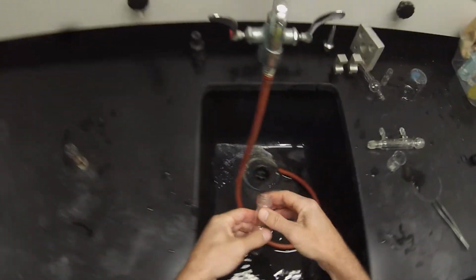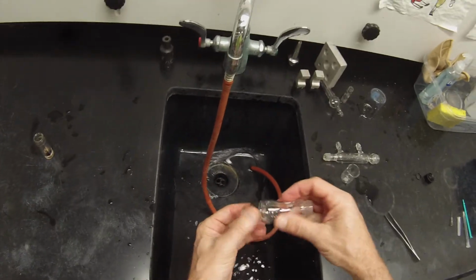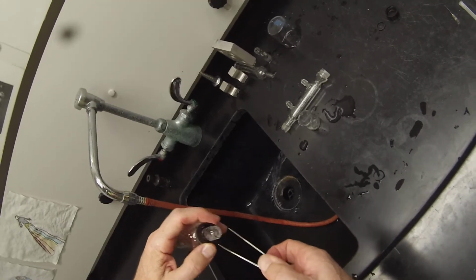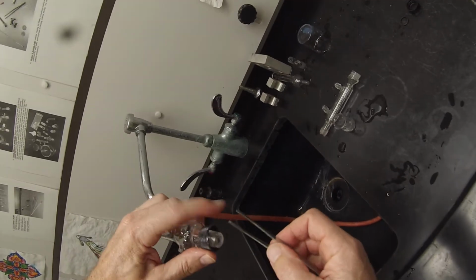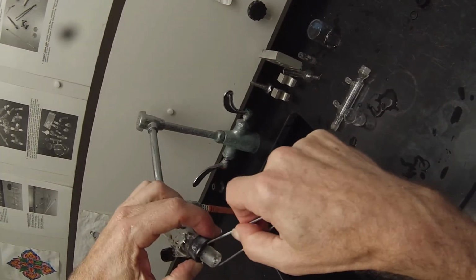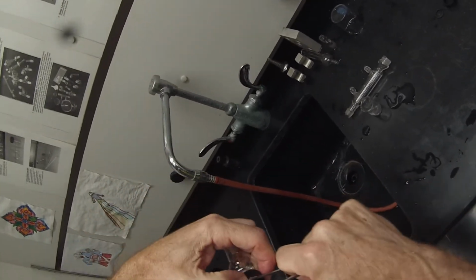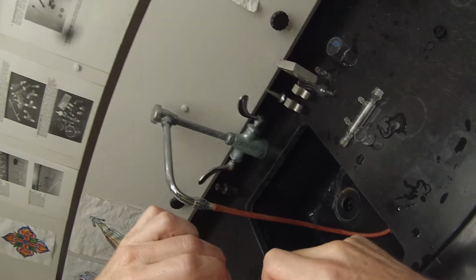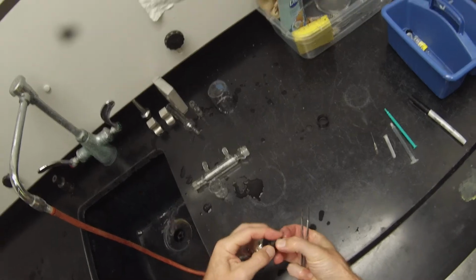So we got those apart. Really good rinse. And as I said, to get that O-ring out of there is going to be a little difficult because it's so short. So I probably can't get it with my fingers. So I'll have to reach in there with either a pair of tweezers or a spatula so I can grab the end of it. So it's a little bit of a challenge to get the O-ring off the Hickman still. There we go. Got it.